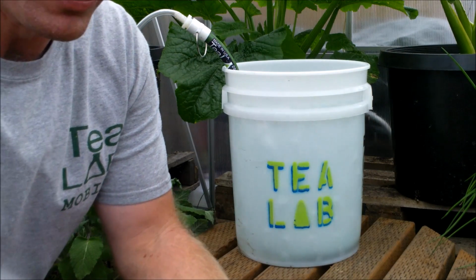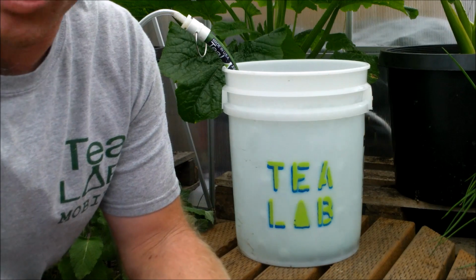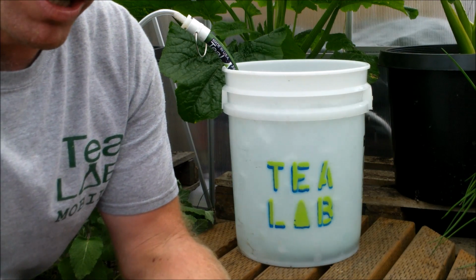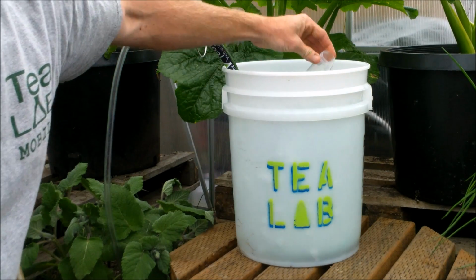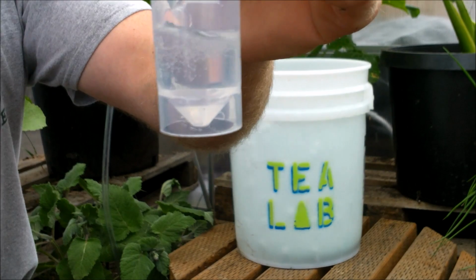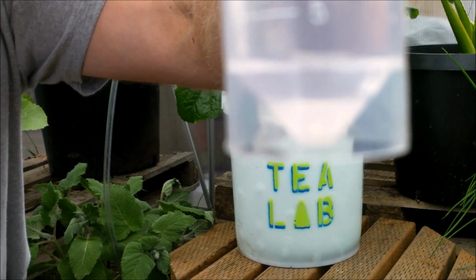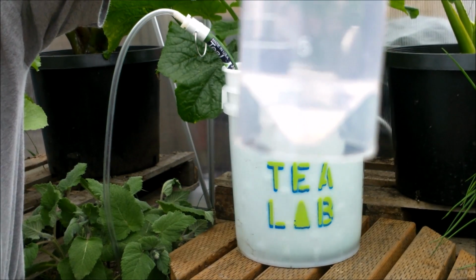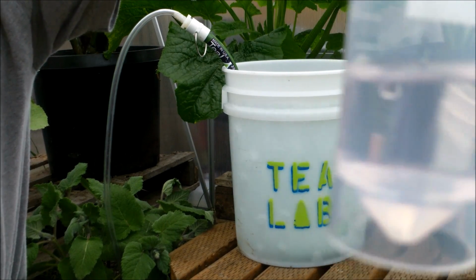All right, everybody, it's me one more time. Hopefully this will be it. It'll be 5 hours now. I started this whole experiment at 1:20. It's just about 6:20 right now, so 5 hours have gone by. And we are going to see if 5 hours of bubbling has gotten rid of all the chlorine and chloramines in our water here, and then we'll be able to make some good compost tea. That's about 10 mils. Dumping it in. There's still a slight color change. I see a little bit of pinkness there, but that's pretty minimal. I don't know if I'm calling it good or not. I bet 1 more hour and it's going to be totally clear. You guys might not even be able to see that, but hey, I'll hang out for another hour and see what's up.